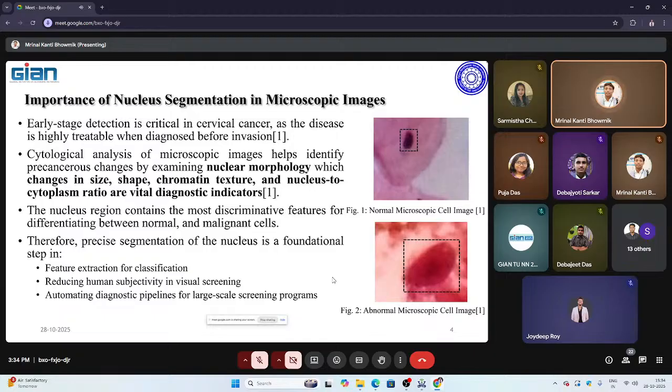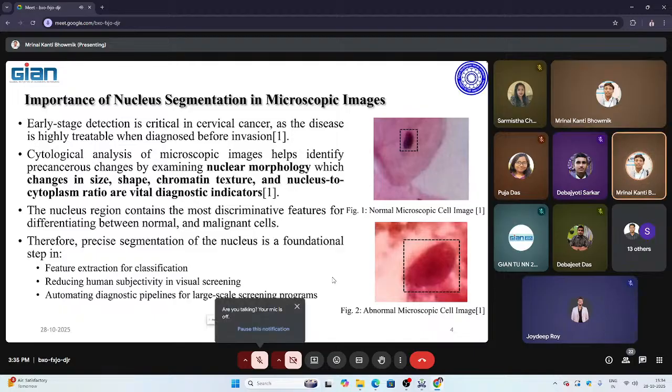So this kind of every step and their knowledge and how to write a program in Python, Shashwata will give this demonstration. So I am requesting Shashwata, please start your demonstration, please. Okay, thanks a lot, sir, for giving me an opportunity.